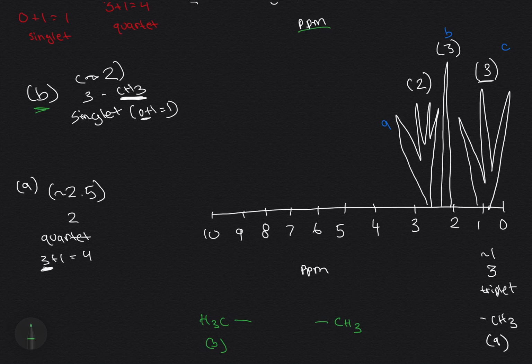Generally, the singlets, it could be a carbonyl group like that. It could be 2 bromines or something attached to a carbon, like just anything with no hydrogens on it. So how to figure that out, you would look at your chemical shift. We're looking right at about 2.1, somewhere around there, and you look on your chart, what shows up at 2.1, what kind of hydrogen. It's going to be a hydrogen that's next to a carbonyl group. So it's safe to say we could draw this carbonyl group as I had already drawn there.